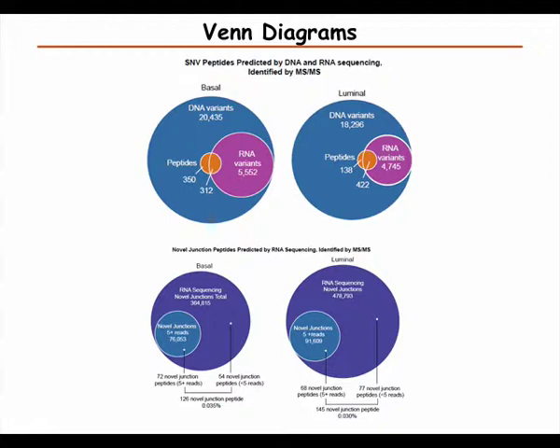So now we go to talk a little bit about other visualizations. One thing that can be very nice is to show Venn diagrams. But usually there are always tools that generate Venn diagrams automatically. But if you want to do a Venn diagram like this for a figure for a paper, you have to do it manually. Otherwise, the automatic tools will not do it usually very well.